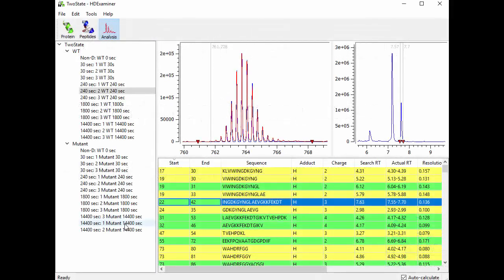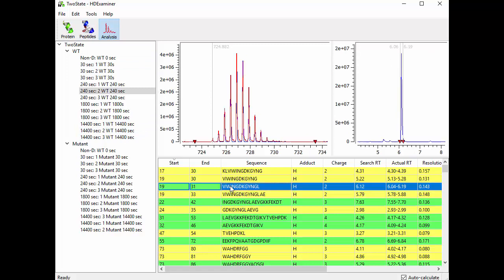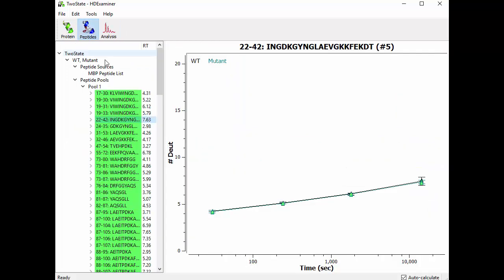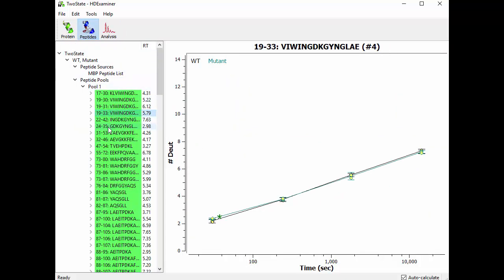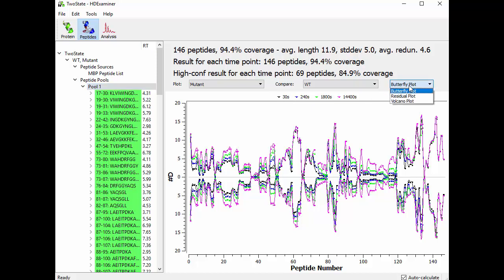So here we have some data. It's already been calculated and we have triplicates at each of our time points. So we can look at the data, we can look at the uptake plots if we like, and now we can also go to the peptide pool here. We can select our two states, the mutant and the wild type for this project, and the butterfly plot you've probably seen before in HD Examiner, but now under this menu we have a new thing called the Volcano Plot.